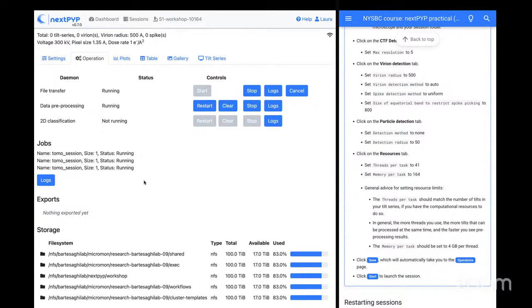Even during data collection, if I start to transfer my data, even on the external disk, I see the slowdown. So while it's transferring the data to another computer where we run nextPYP, does that affect the data collection? I want to say generally, IO does incur some compute power, but it shouldn't be so much that you slow things down too much.